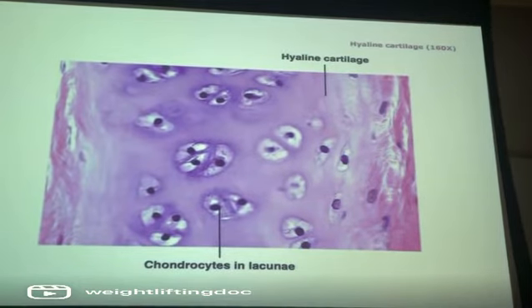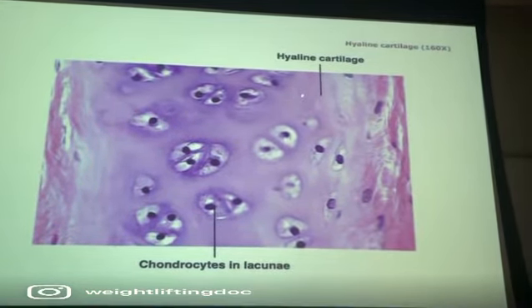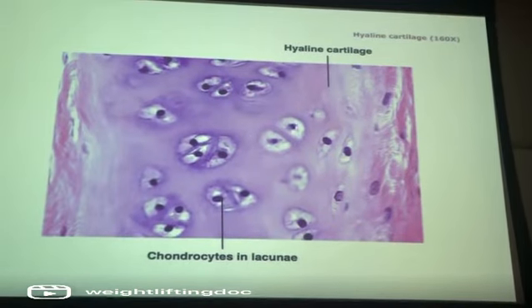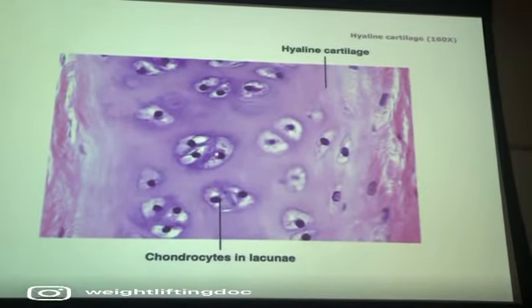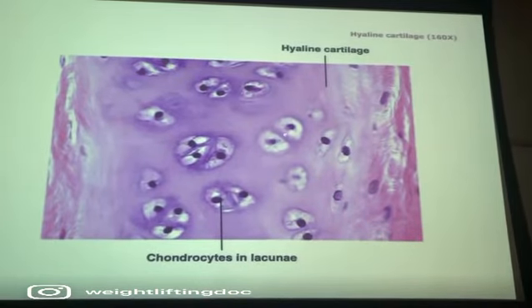If it is a cartilage slide, you have to say cartilage, okay? And so if you look on this one, it's hyaline cartilage. It looks like smooth glass or ice skating ice. So there's an ice skating rink, and I always say that these little guys here are the ice skaters. And those are actually called chondrocytes, each of those.